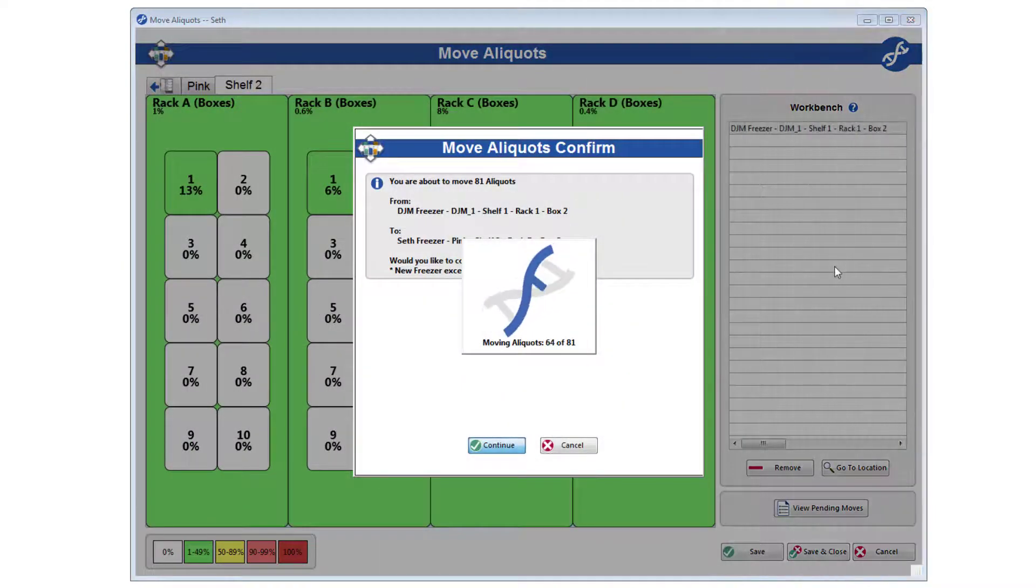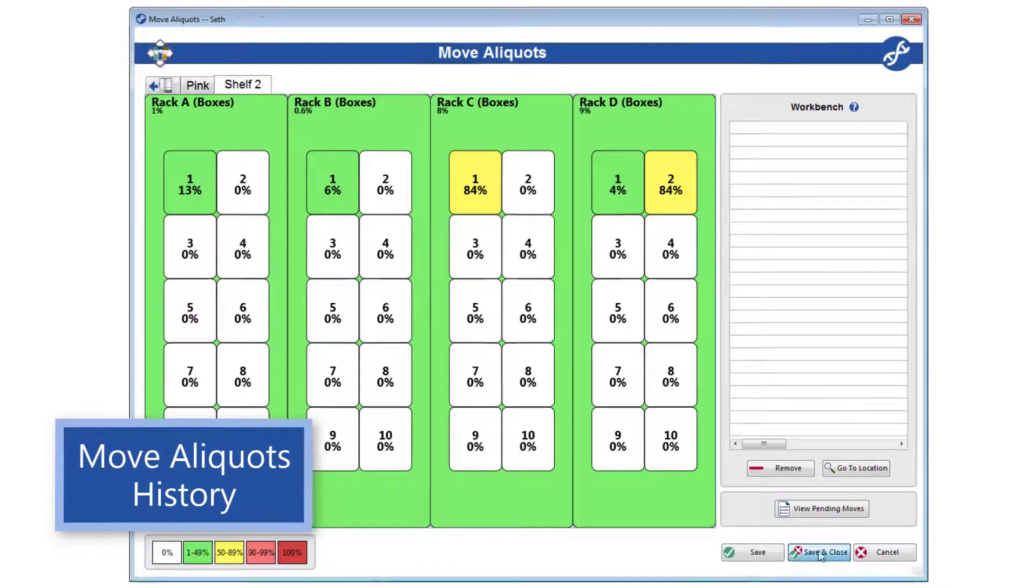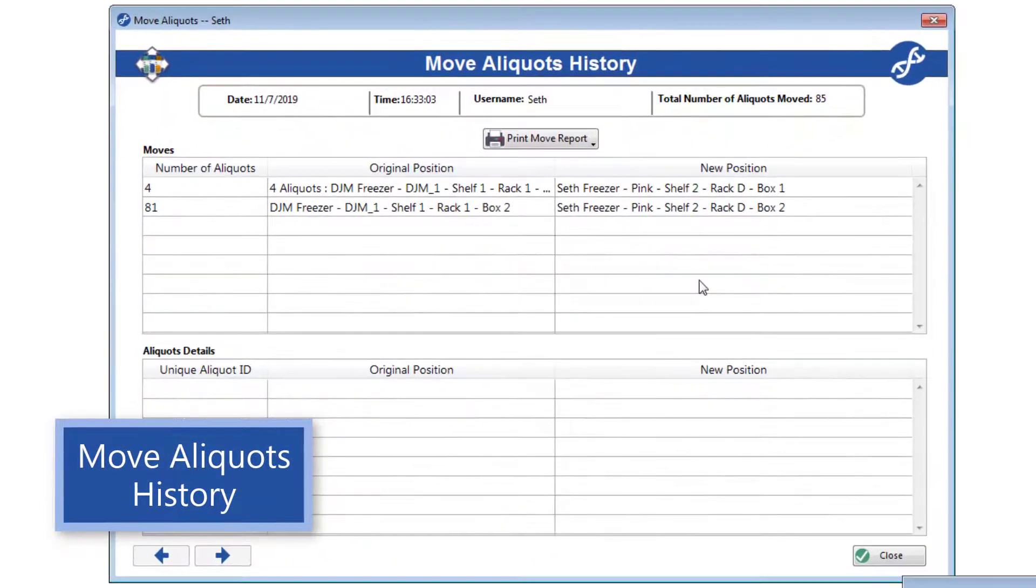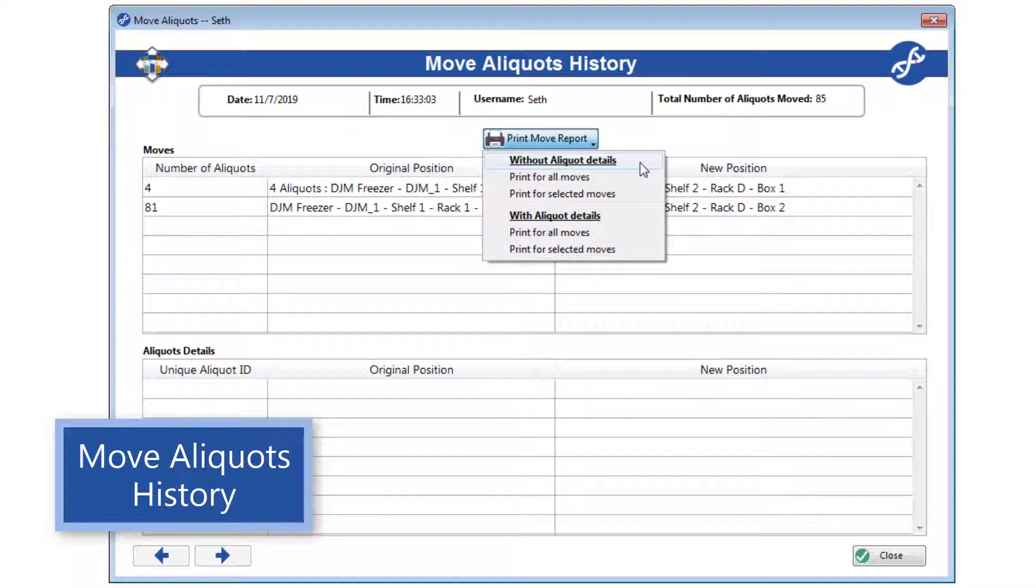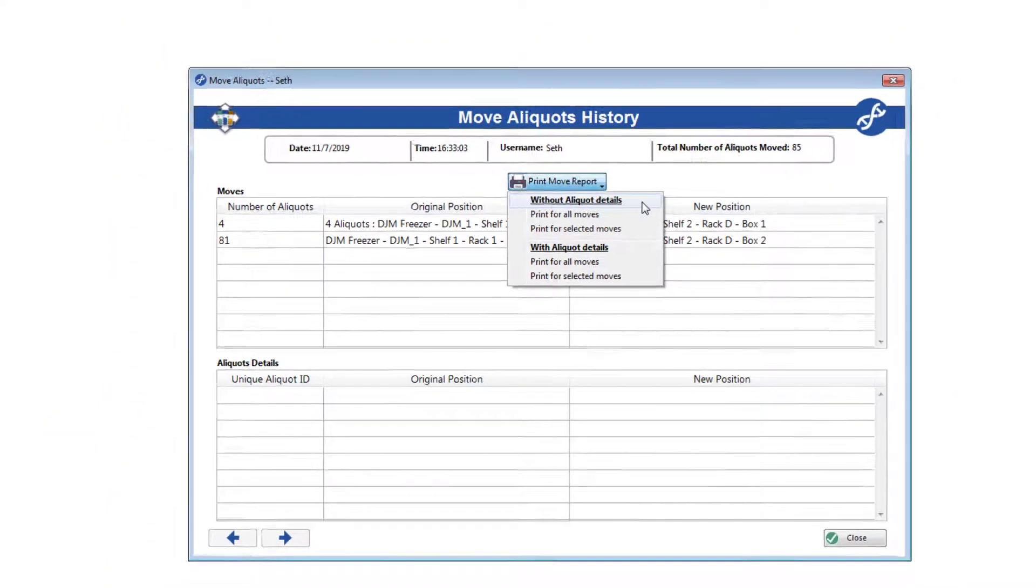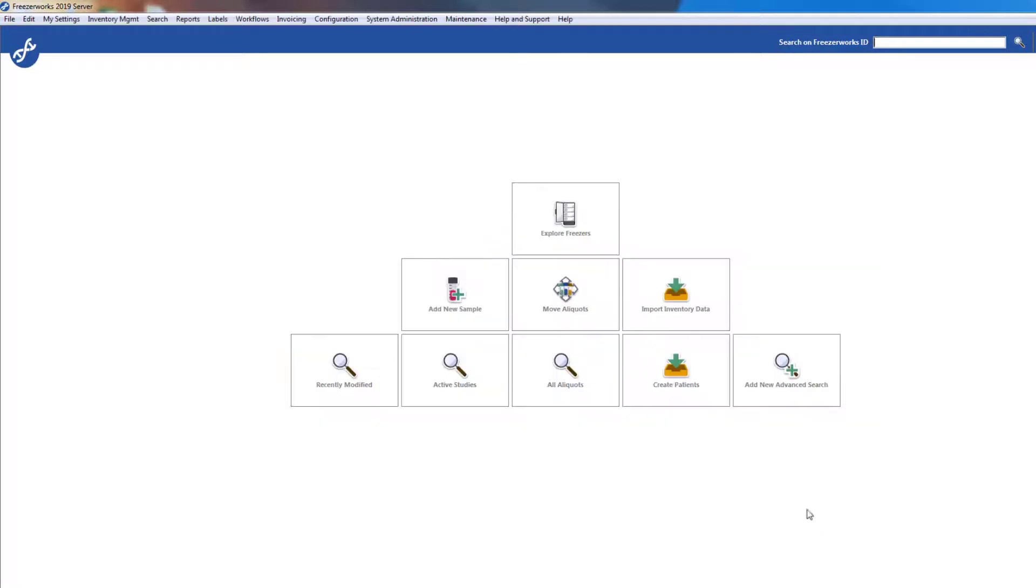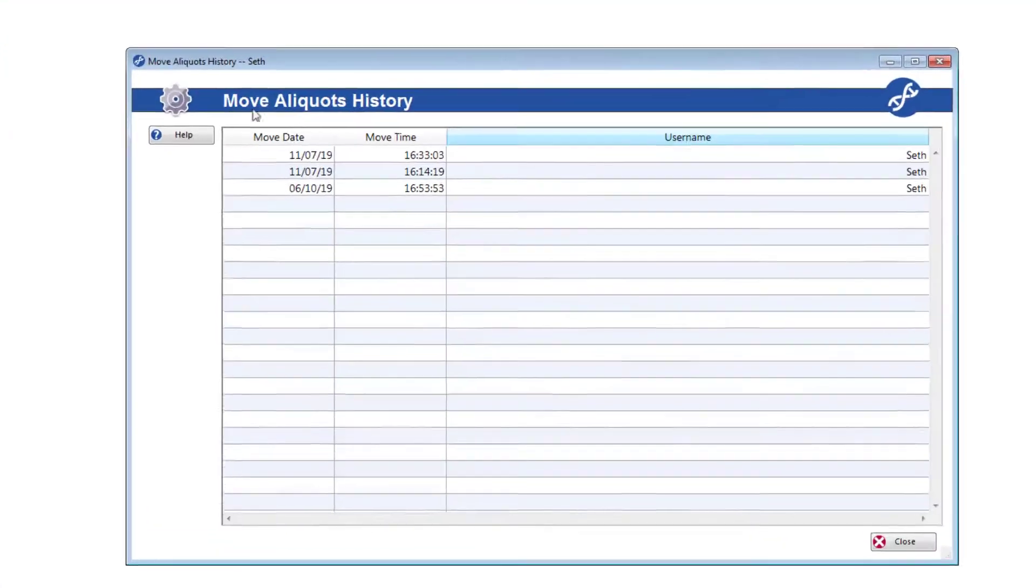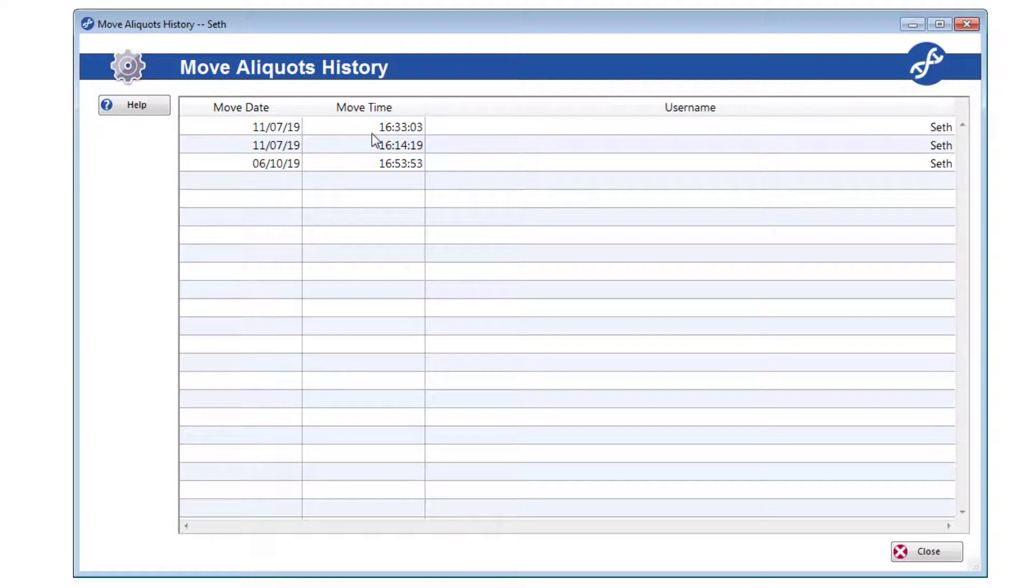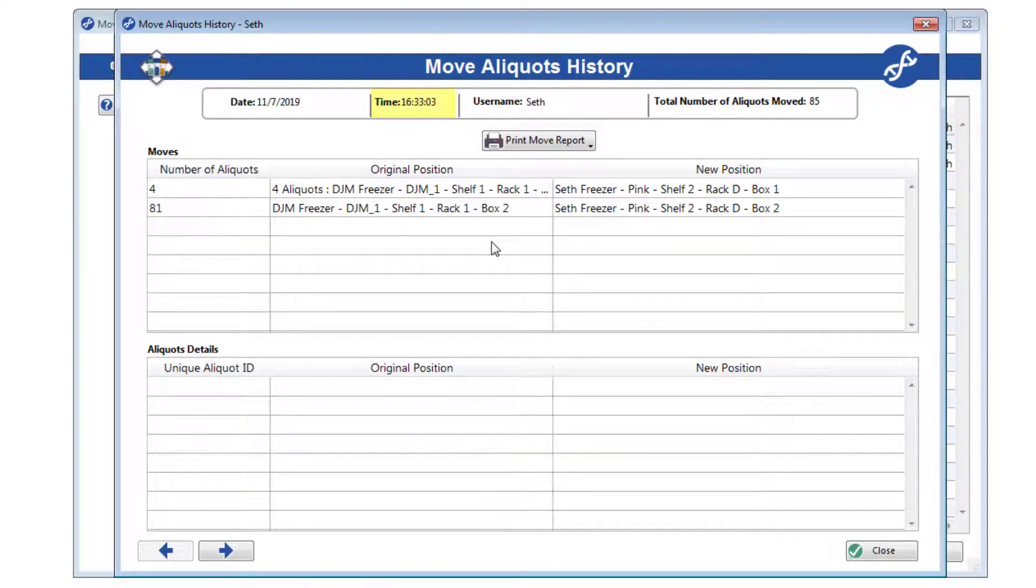When you are finished moving aliquots, a move aliquots history report will appear. You can print the report now for all or some moves, and with or without details, or do it later by accessing move aliquots history in the reports menu. The history records themselves are the same as the View Pending Moves form, only with a timestamp.